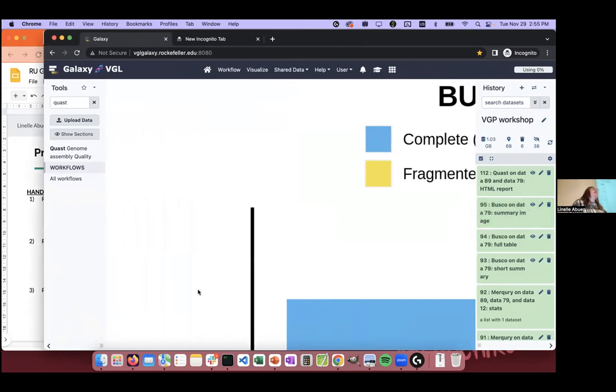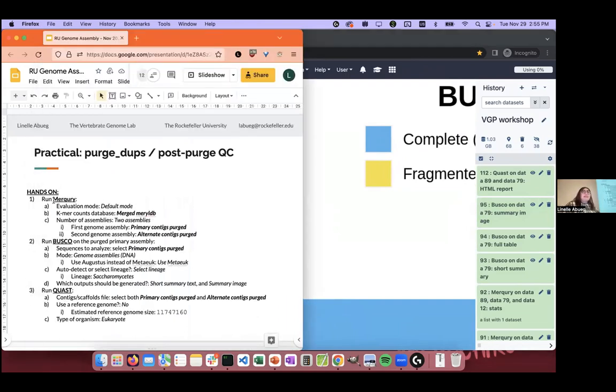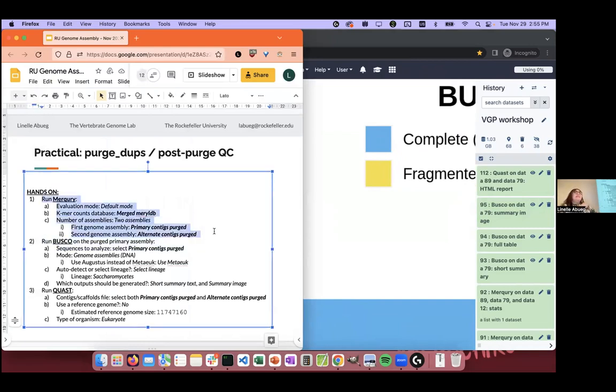I follow through all the process, but could you explain in easier, understandable language what exactly each step is? Which step is what? Sorry. What exactly each step is like? Oh, sure. Yeah. I understand the high-level concept, but I don't know the order. This is number one in this slide? You mean the whole purge step?